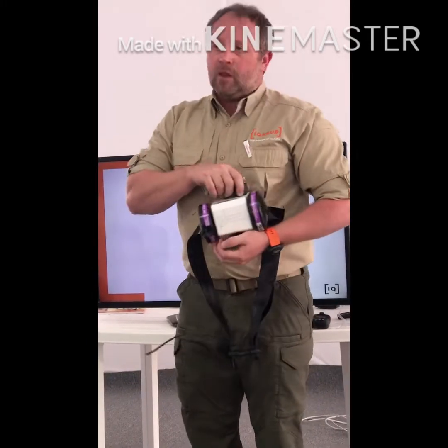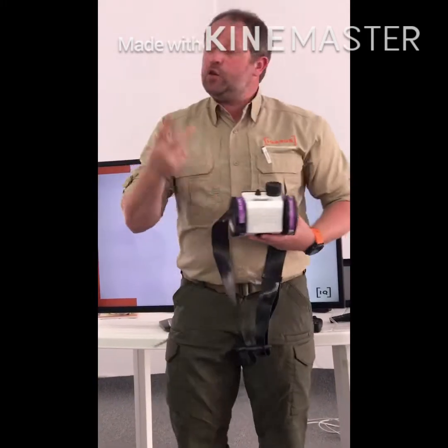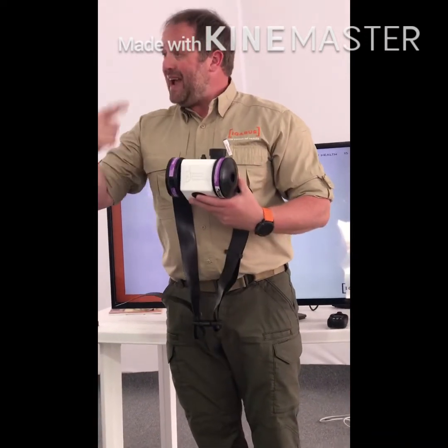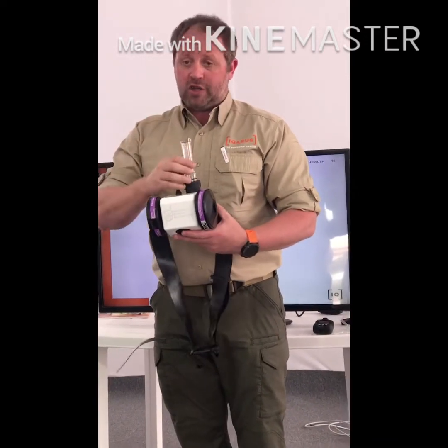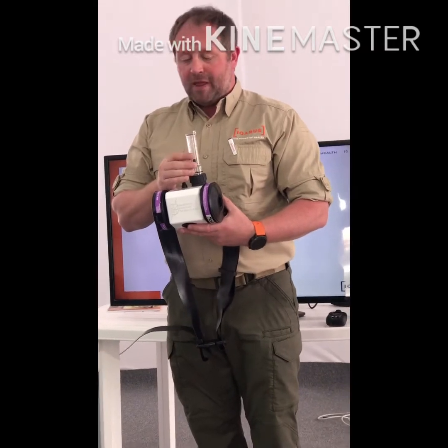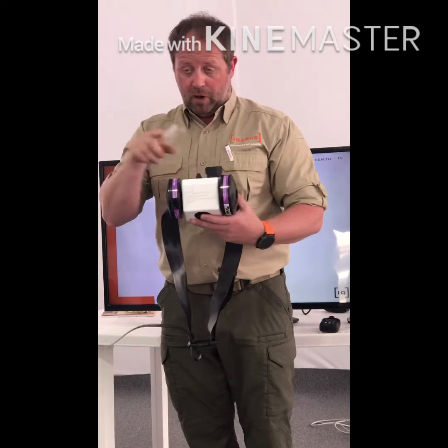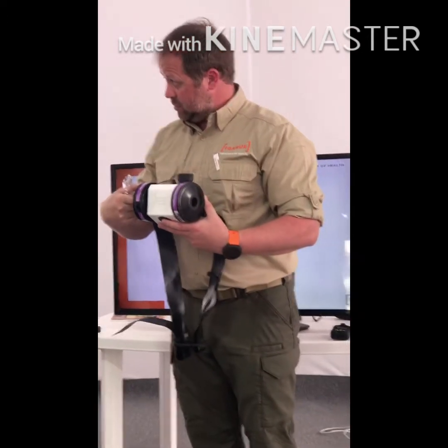Okay? So if at any point when you're wearing this, you start to feel it's becoming a little bit more difficult to breathe, get decontaminated, go check it. If it drops below 4, you need a new one. Either a new motor or new canisters. Okay?